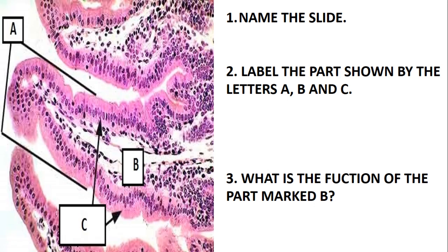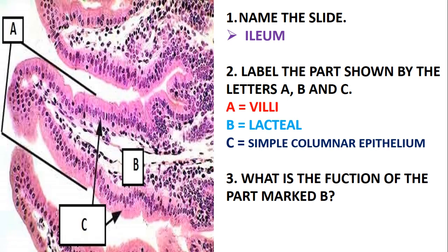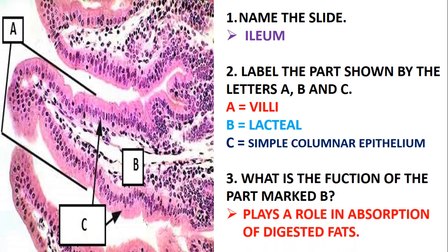Name these slides. This is coming from the intestinal part — this is just the ileum. Label the parts shown by the letters A, B, and C. A is just a villus. B is the inside area, which is just the lacteal, playing a role in absorption of fats. C is just simple columnar epithelium. We need to understand that from the stomach up to the large intestine you find simple columnar epithelium.